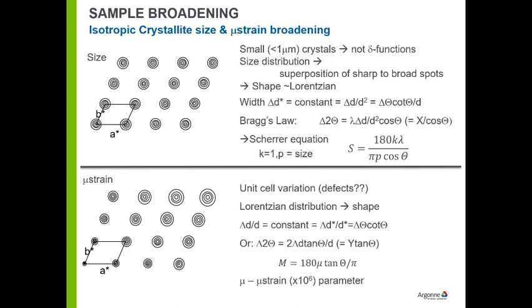If you reduce the size of the crystal, the Fourier transform then gets broader, right? Everybody knows that? Yeah. So with small crystals, you don't get delta functions, you get peaks in reciprocal space, and they are the same width in reciprocal space, assuming it's isotropic.